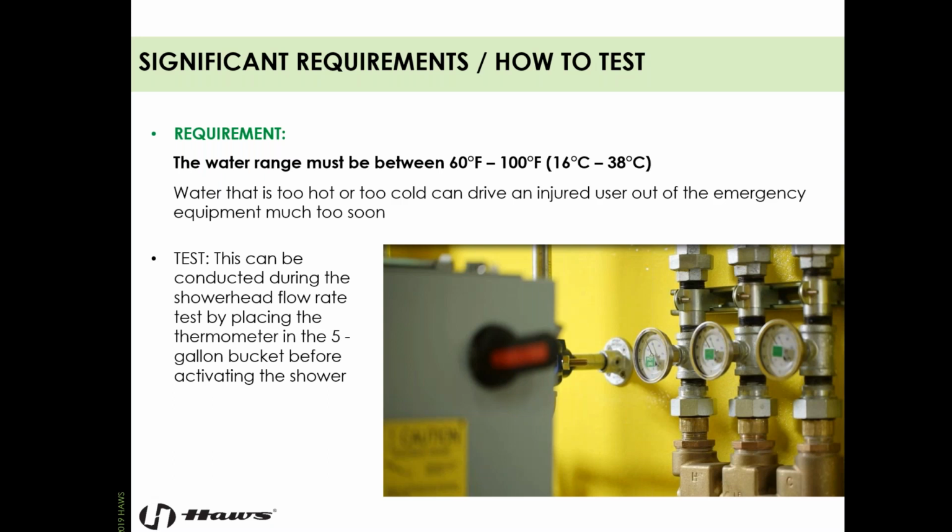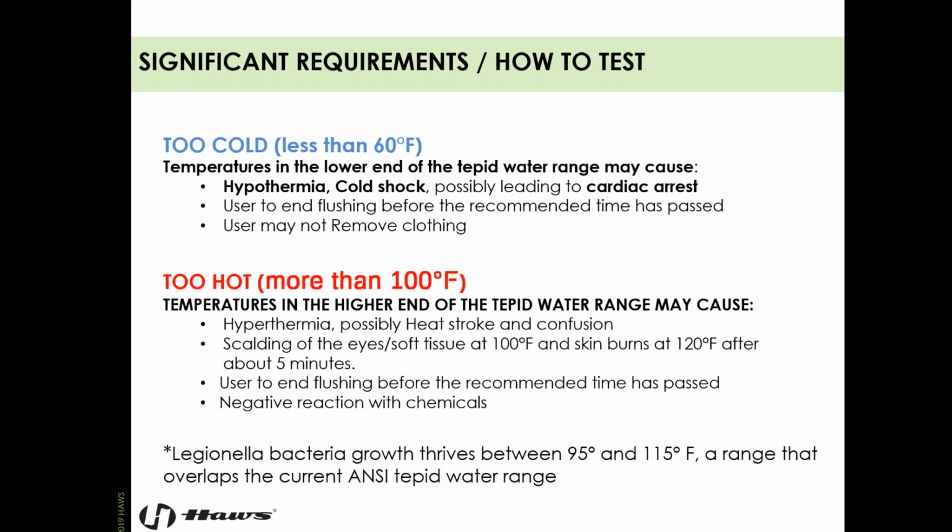I don't know if you've sat in 60-degree water before. It's pretty cold. Anything south of that, and we're getting to the point where you have additional medical concerns that may arise. One of them being hypothermia, cold shock, possibly leading to cardiac arrest on top of what you're already dealing with, right? And it may discourage the user from removing their clothing, okay? And we don't want that.